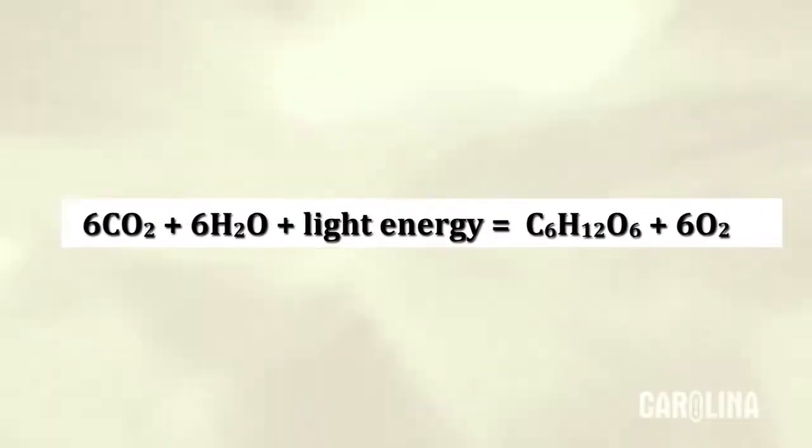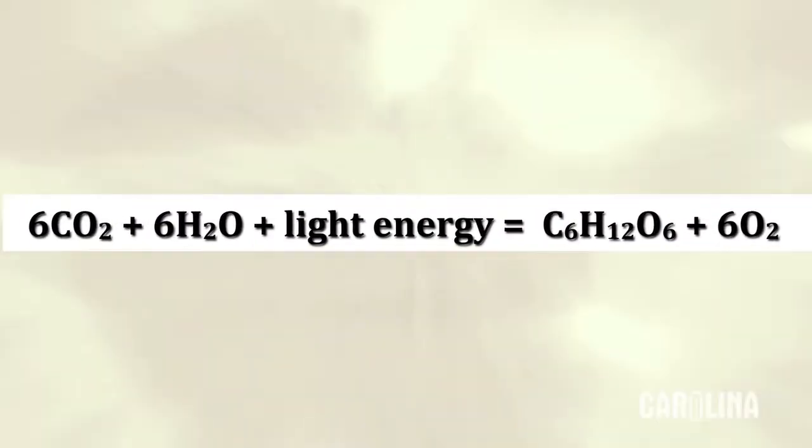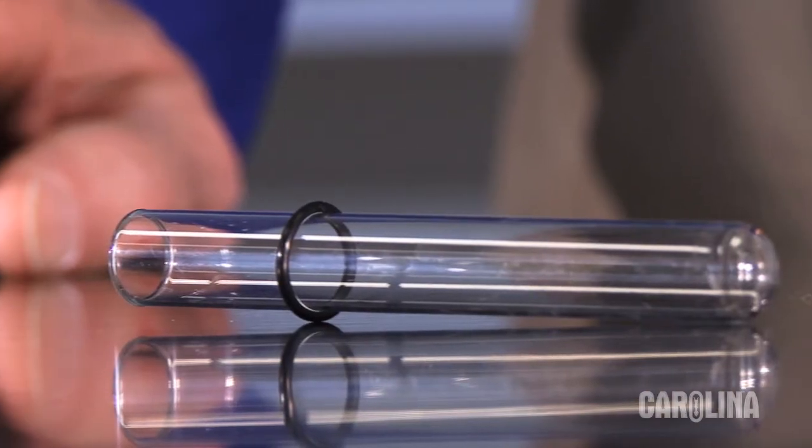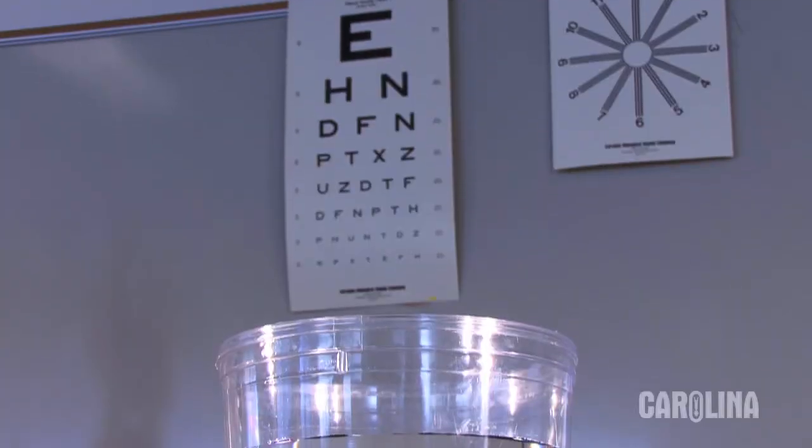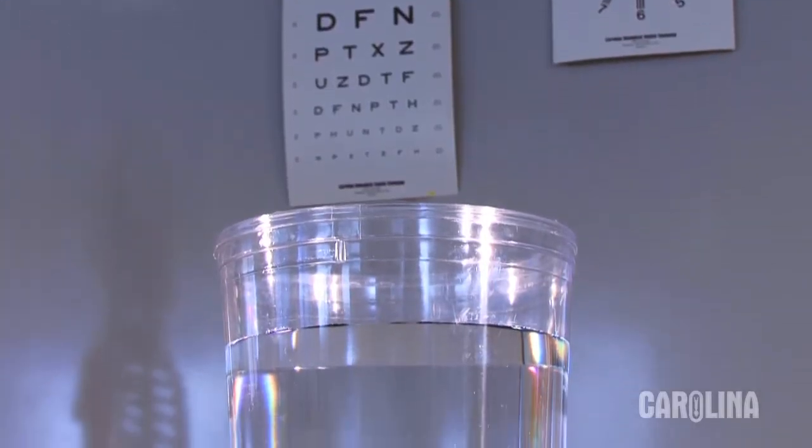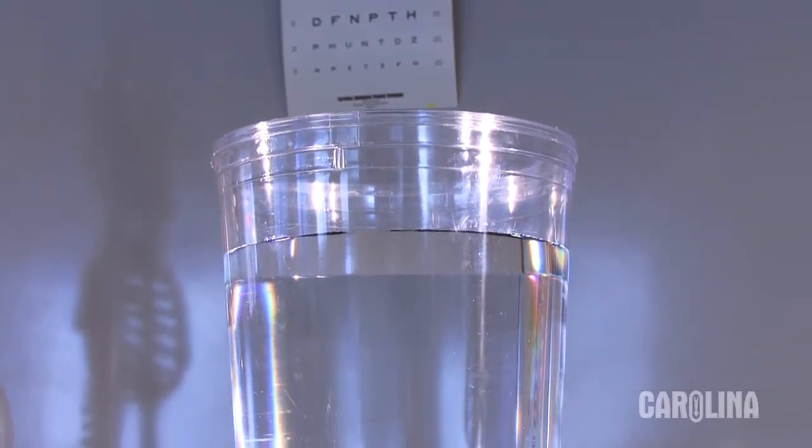Oxygen is a byproduct of photosynthesis. You can collect oxygen from photosynthesis in a test tube. Here's how. In this container, I have room temperature dechlorinated water.